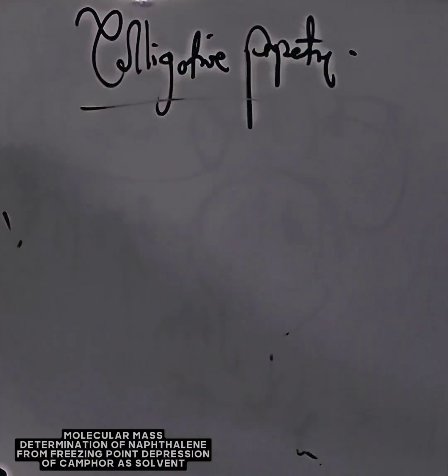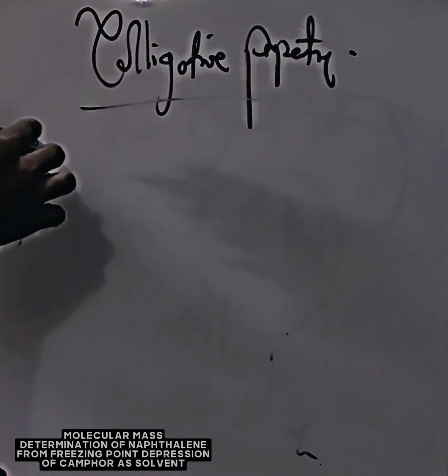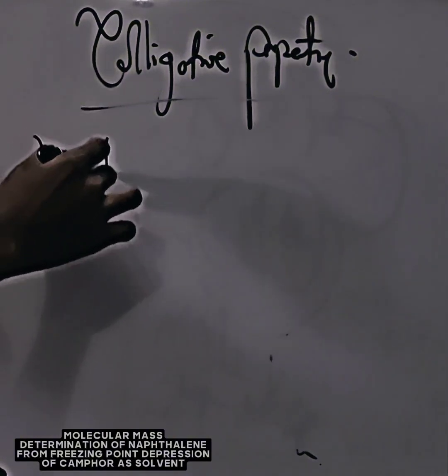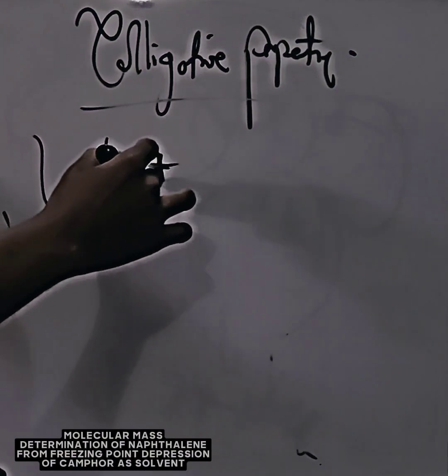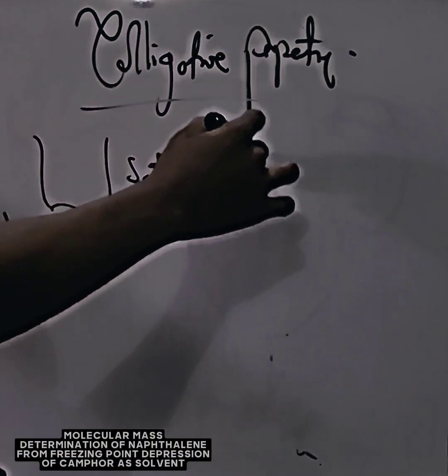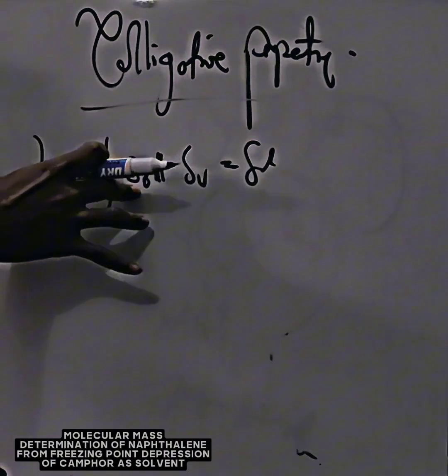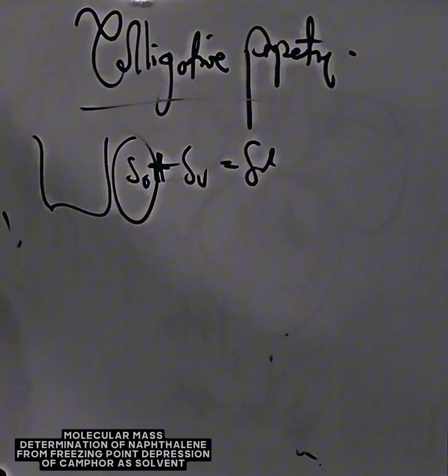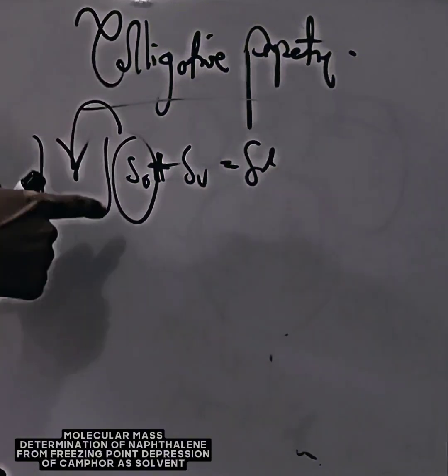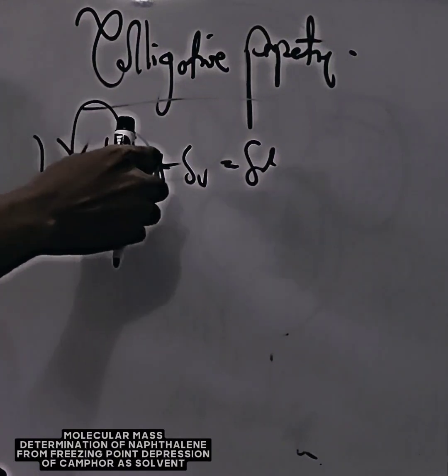Okay, colligative properties are just a physical property of a solution. When you have a solute plus solvent, you have a solution. So it's a physical property of a solution that depends on the amount of solute. It depends on the amount of solute particles rather than the specific identity of the solute.